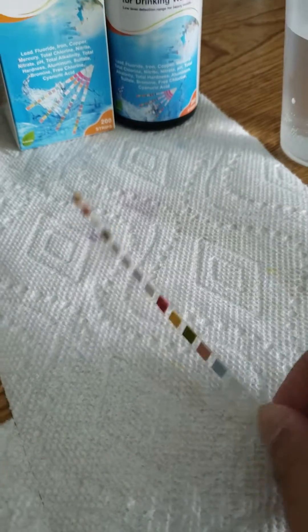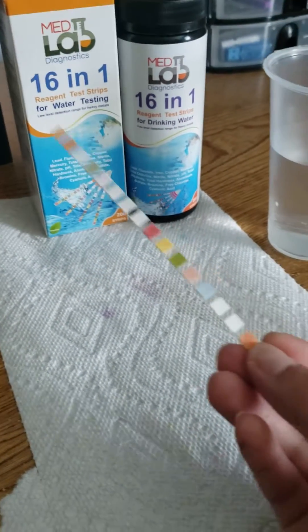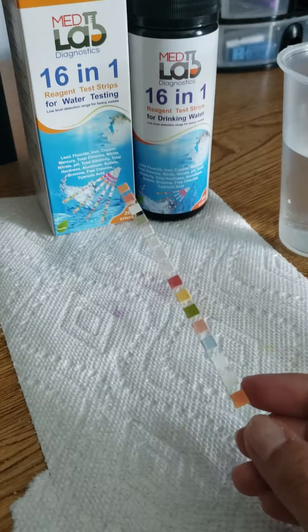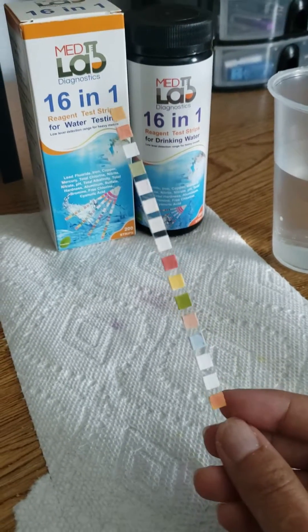When you take the strip out, you can see it's on a biodegradable clear strip, which is cool. And you can see all 16 parameters are here on the strip. When you first take it out, some of them will be colored and this is normal.